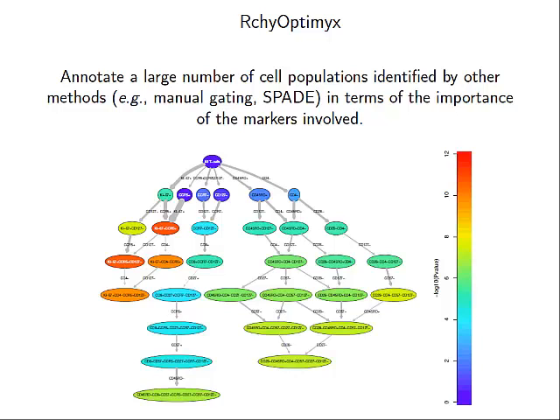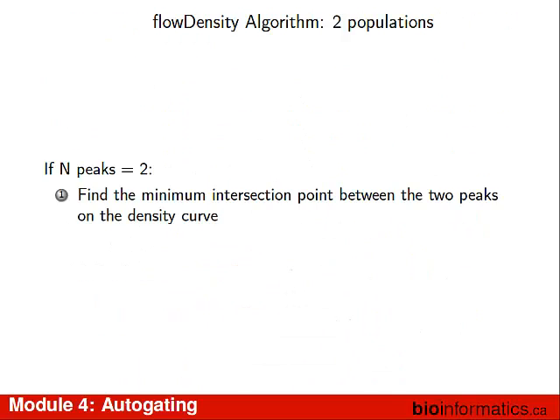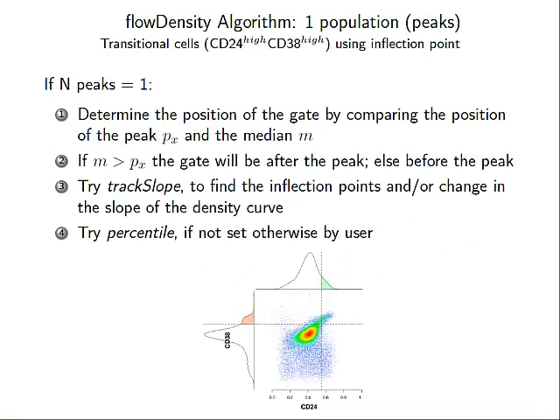You mentioned that the biggest problem with your platform is rare cell populations. So I'm wondering how you deal with gradients, because it seems like what you call the rare cell population could actually be considered a gradient, where cells are differentially expressing, or the antibody is differentially binding in very small intervals across the distance, right? So the question is, rare populations seem to be a problem, how do we deal with them versus an actual gradient?